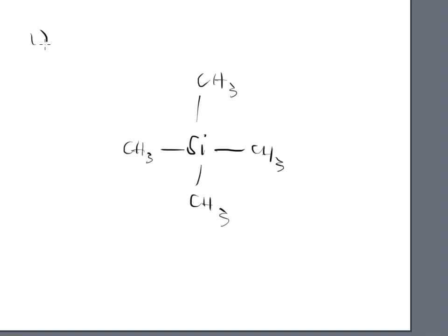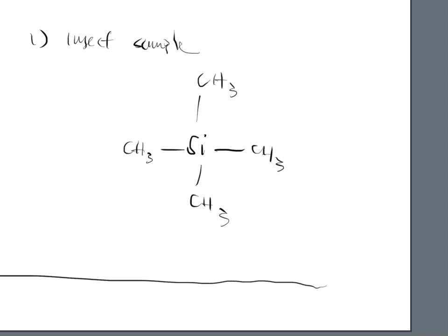As far as TMS is concerned, tetramethylsilane basically means that we have a Si in the center, and tetra means 4, so it's 4 methyl groups, tetramethyl, right? So this is the structure of TMS that we use in the world of NMR. A little bit of this is injected into the actual sample, and on the software or the computer screen, the spectrum begins with my 0 mark.